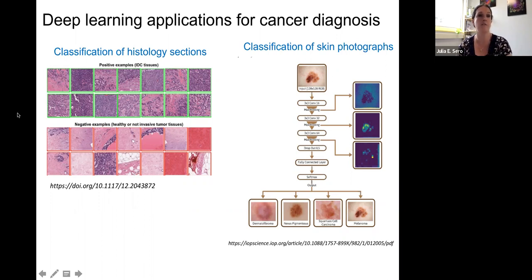We don't necessarily even know what's in the image, but we're predicting that these ones are not tumors and others are tumors. That's obviously using a training set, a ground truth, and then bringing in unknowns and asking, do they fit the class that's defined as the tumors or as the non-tumors?